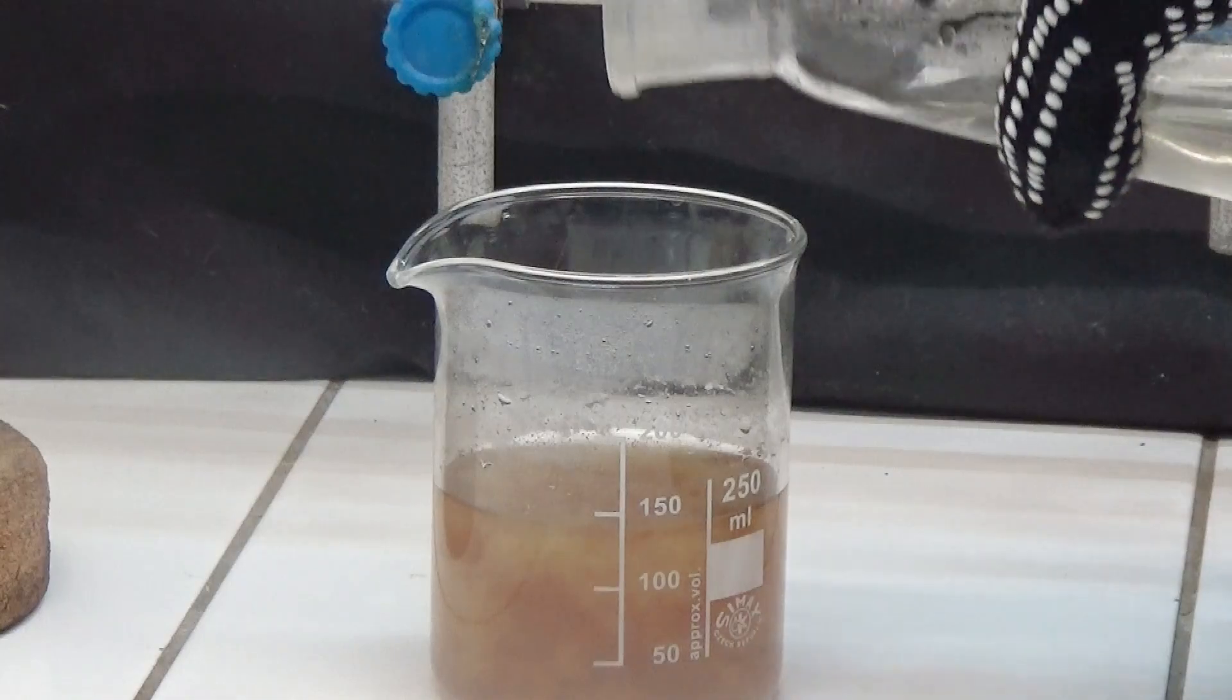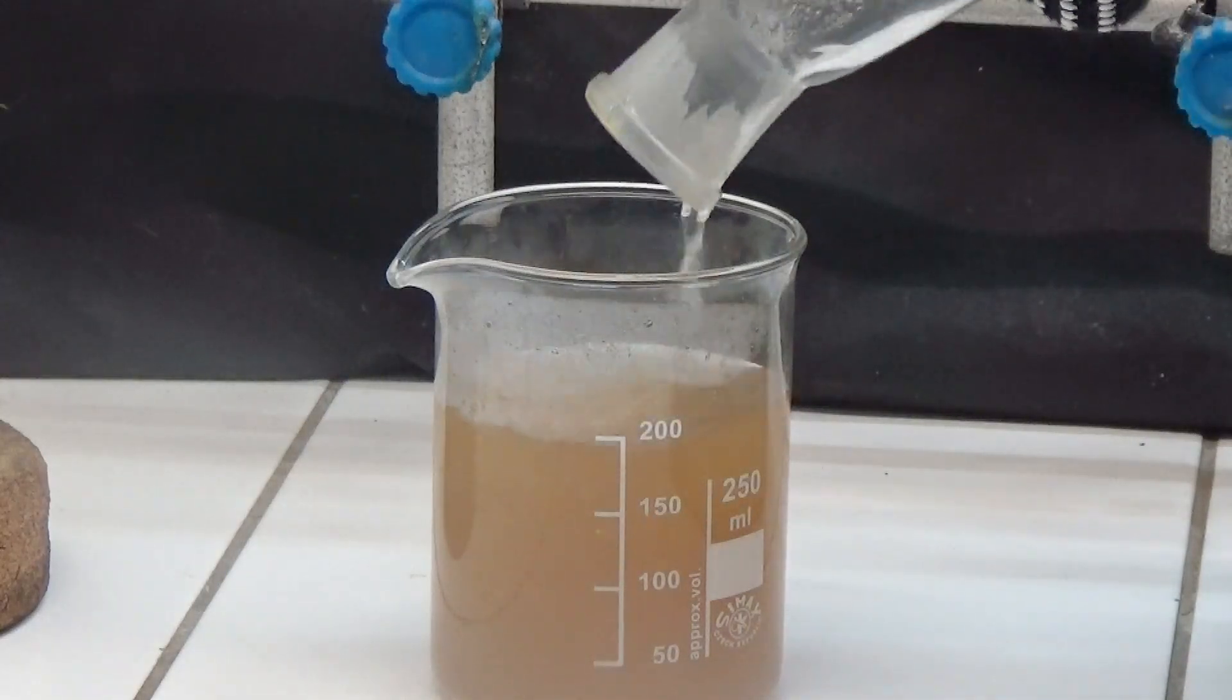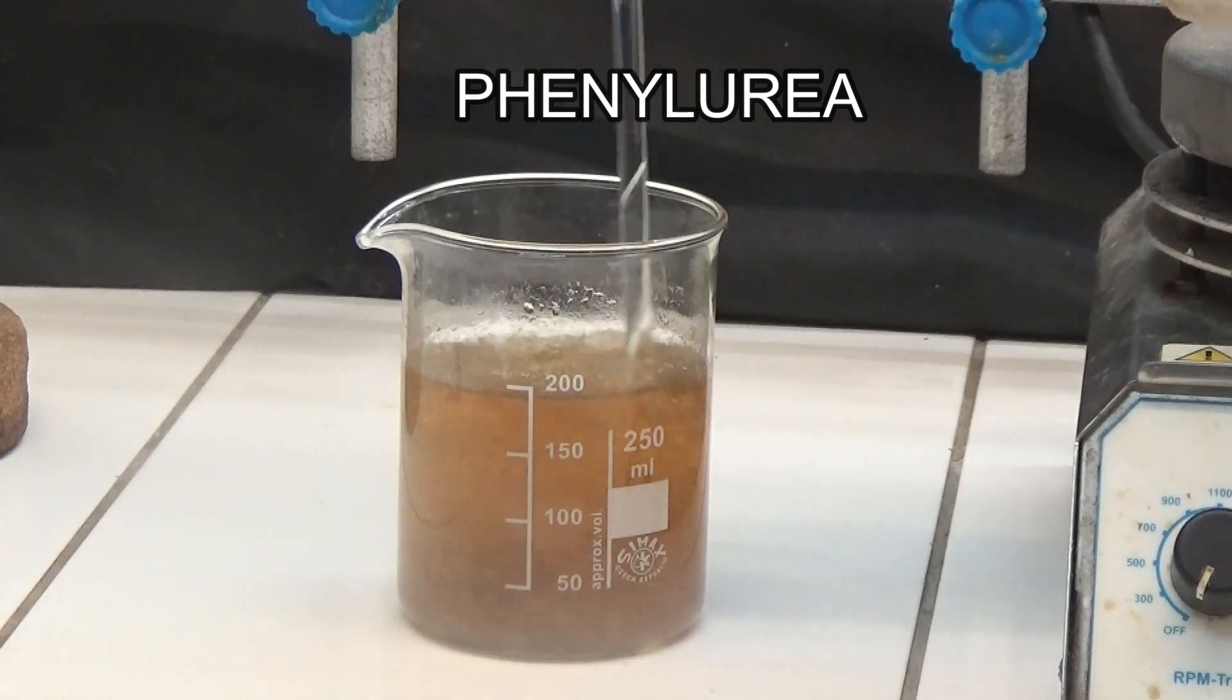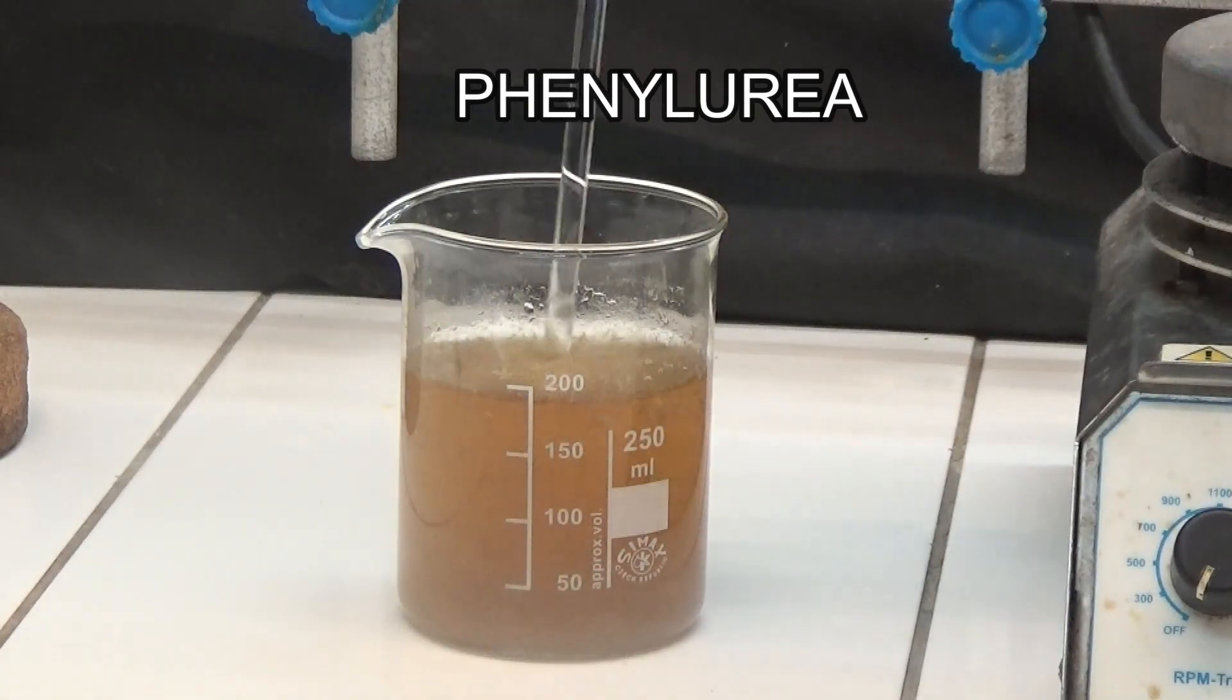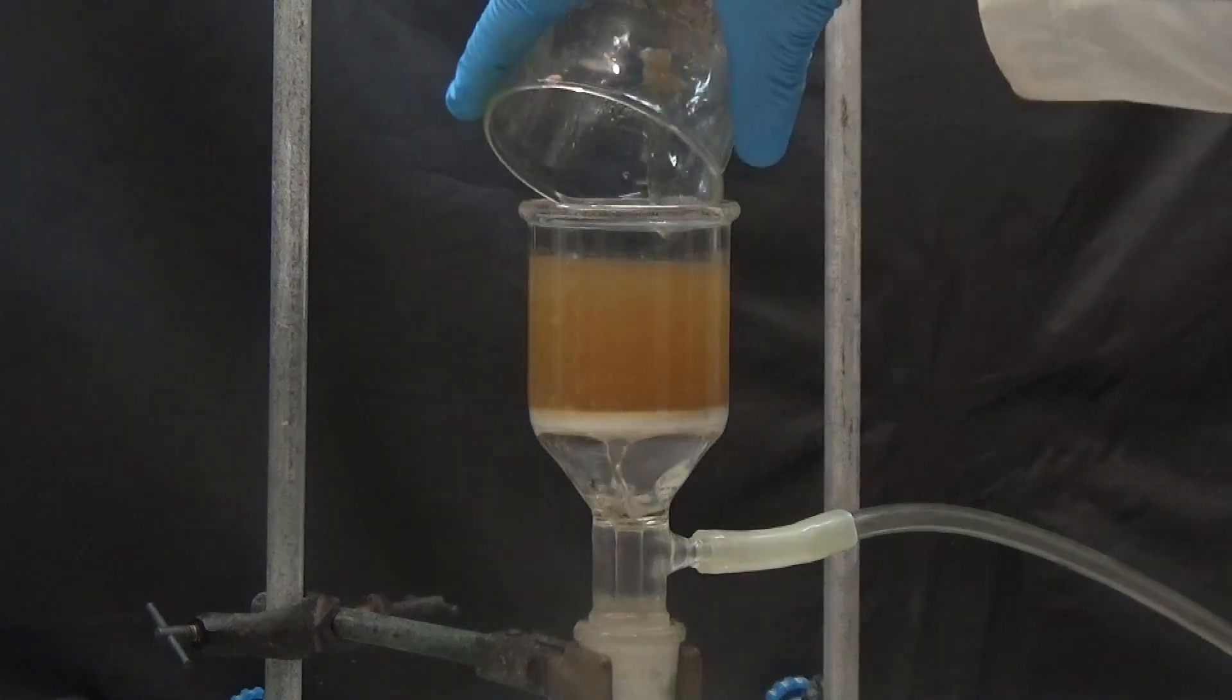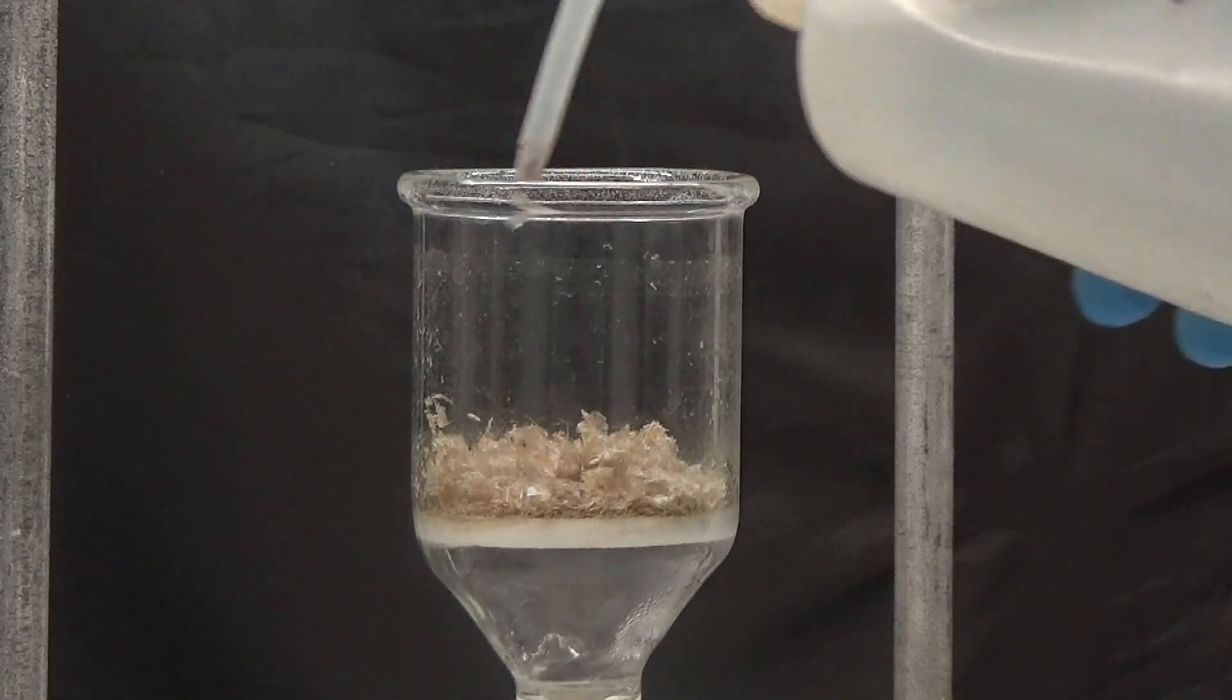The liquid that has been filtered with the 2 washes is permitted to cool. Once the filtrate is cold, the fine needles of phenylurea crystallize. Gather the crystals and wash them using cold water. The liquid washing is discarded.